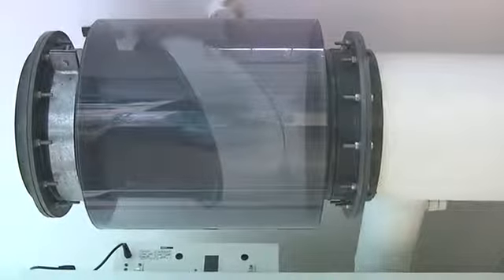The air extract system is provided by the Class 1 safety cabinets, through which airflow occurs via high efficiency particulate absorption (HEPA) filters. The negative pressure in the room ensures that the airflow is continually pulled towards the cabinets and the HEPA filters. All investigations on samples within a Containment Level 3 laboratory are performed whilst working in the Class 1 safety cabinets. The airflow through the entry of the cabinet is maintained at a rate of between 0.7 and 1 meters per second, and therefore the biomedical scientist is protected from any aerosols generated from the manipulation of samples.